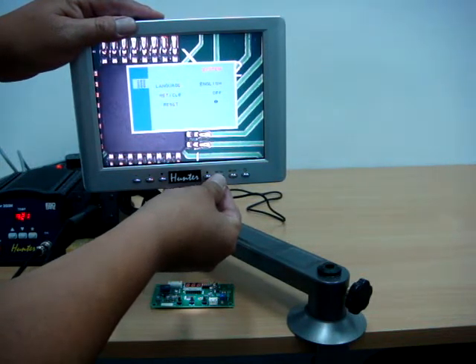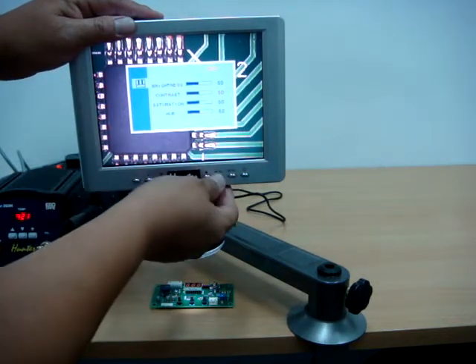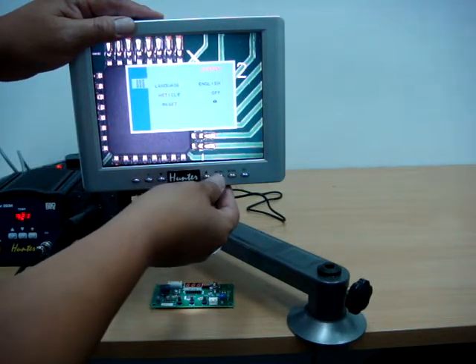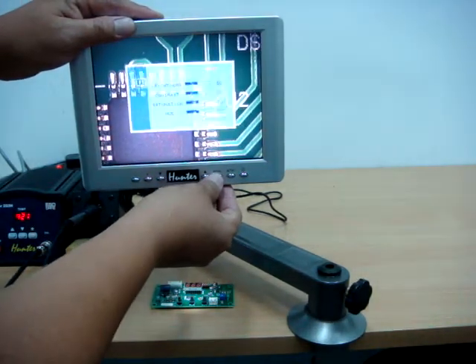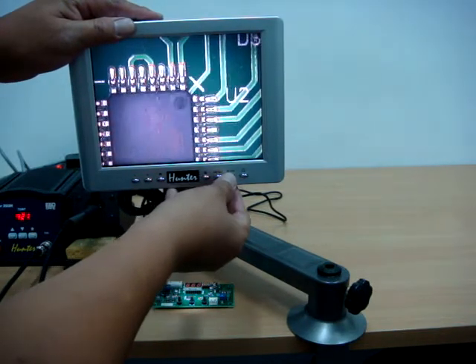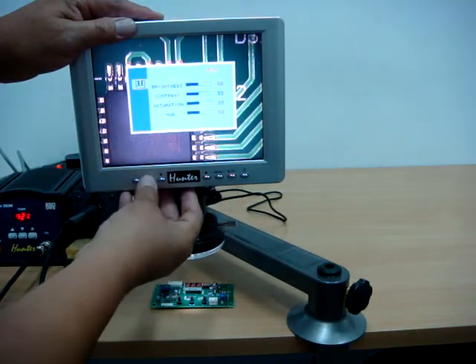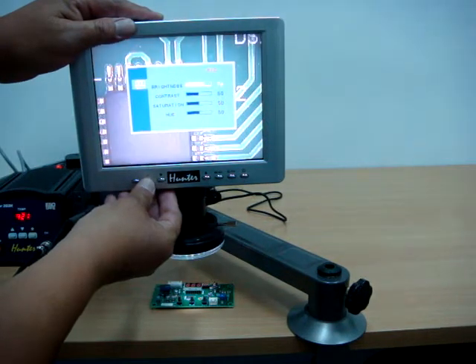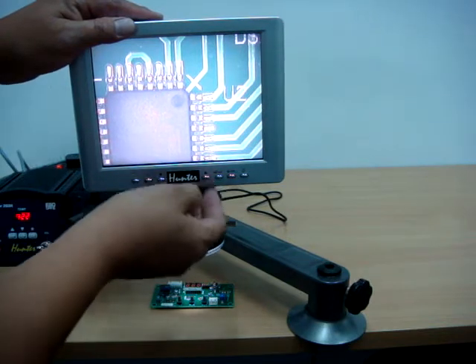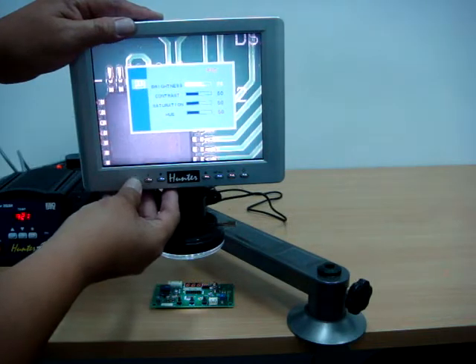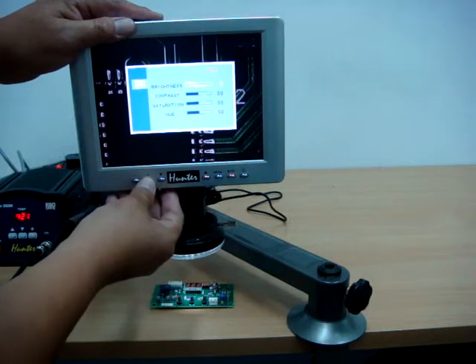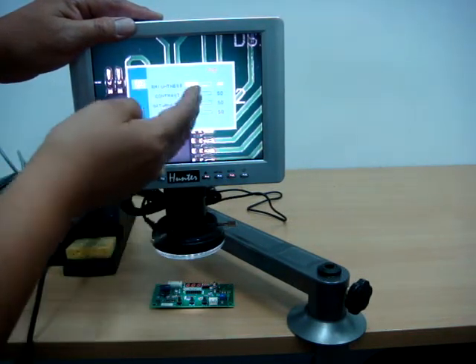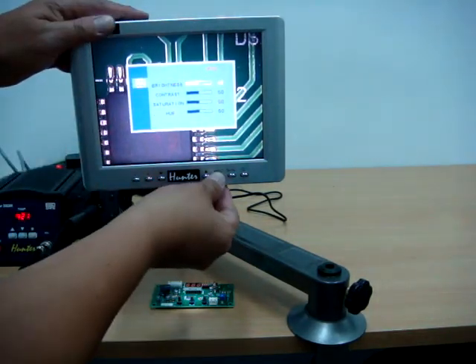You can adjust the settings to see the color, language, and so on. Go to the brightness first. You can adjust the brightness here to be very bright or very dim if you want. You can adjust the contrast, brightness, saturation and hue.